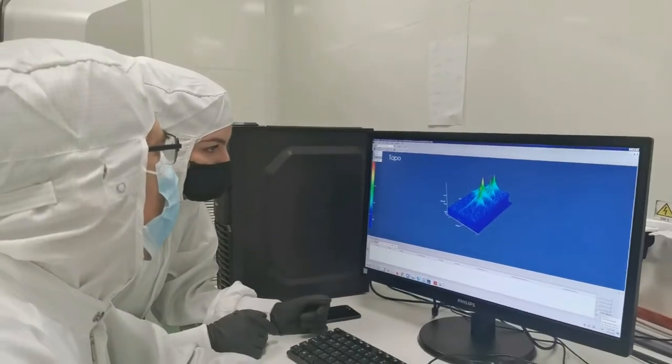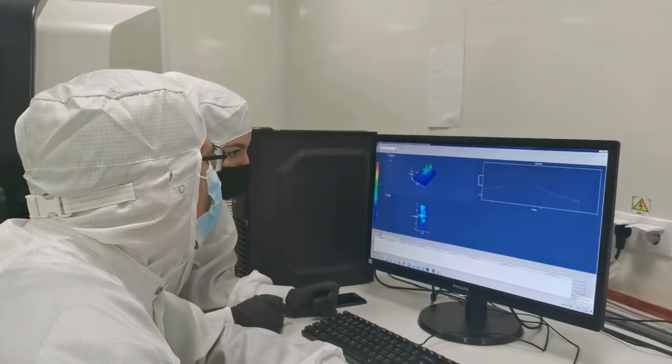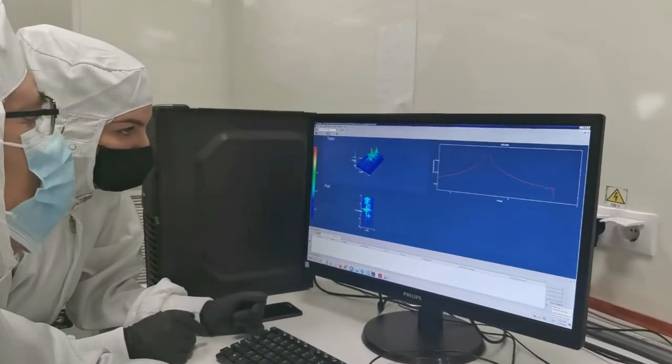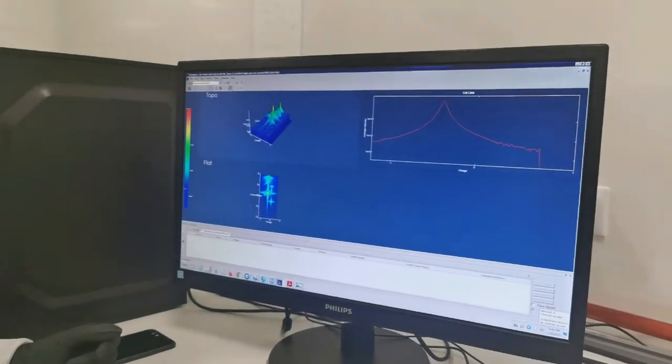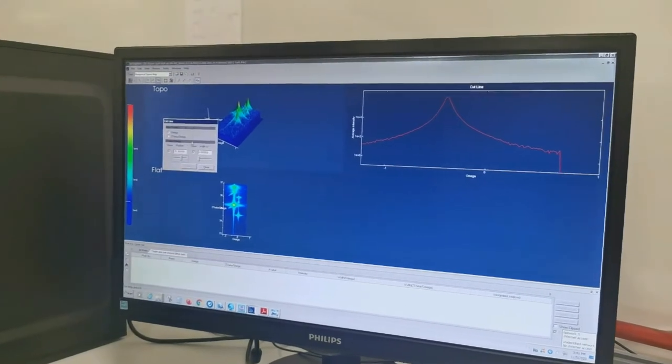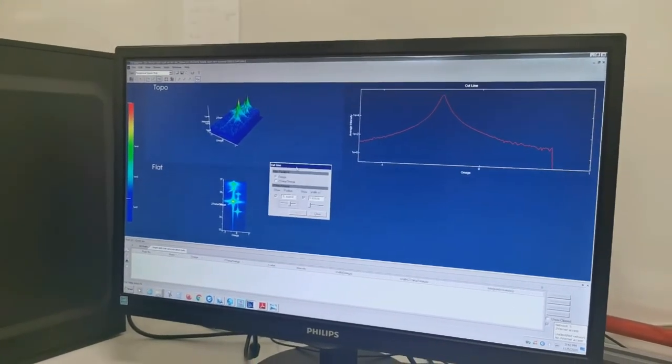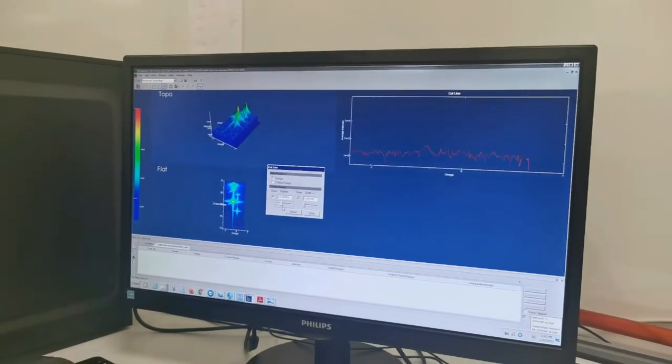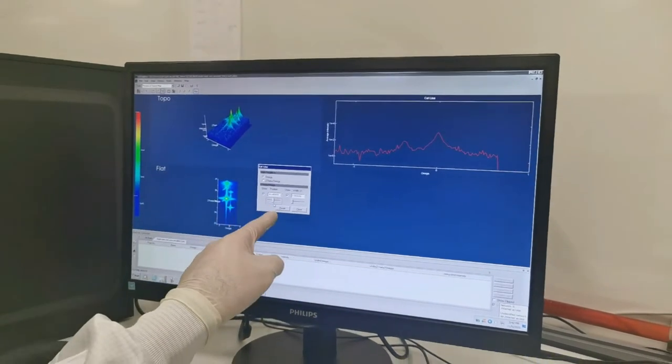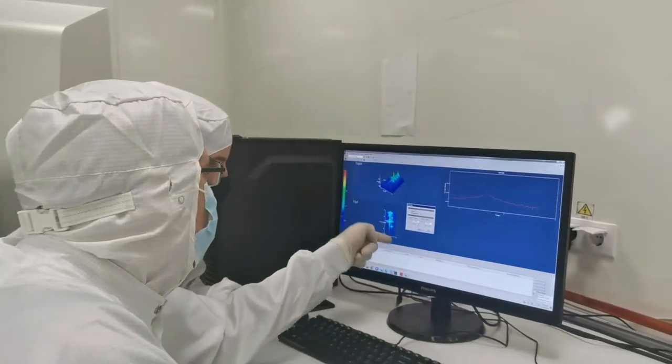Its main features include a 9 kW rotating anode, high-resolution hybrid detector, 5-axis goniometer for in-plane and out-of-plane analysis, and the microfocus.